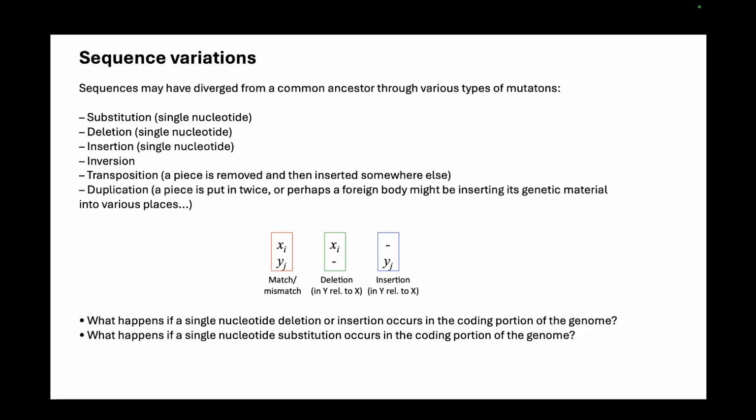So these are the different types of variations that you can have. These are just some of those variations; you can have much more complicated variations as well. But to go with, these are the most commonly found variations that we see in the genome.